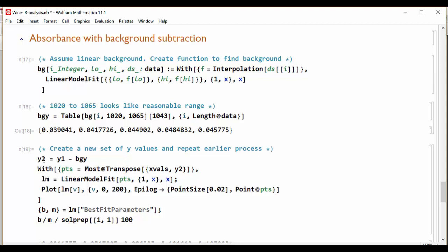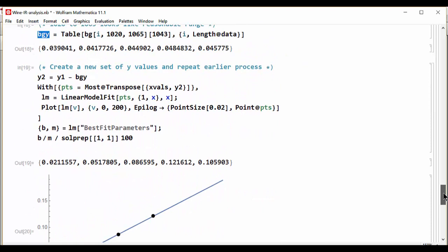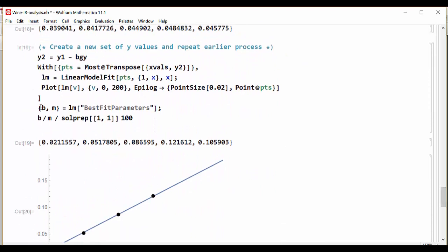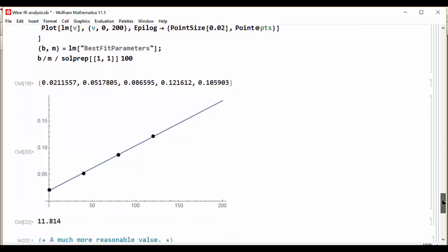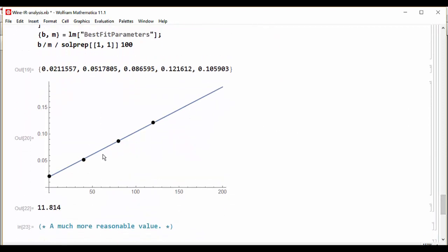And now we create a new set of absorbance values which are background subtracted. Notice how we took BGY, subtract these from the earlier points, do the same process where we create a linear model, plot it, get the best fit parameters. Again, nice smooth Beer's law plot, and now we get a much more reasonable alcohol concentration of about 12%.